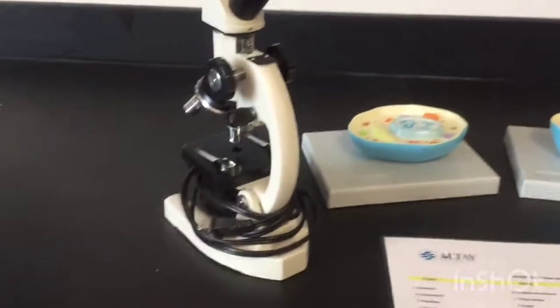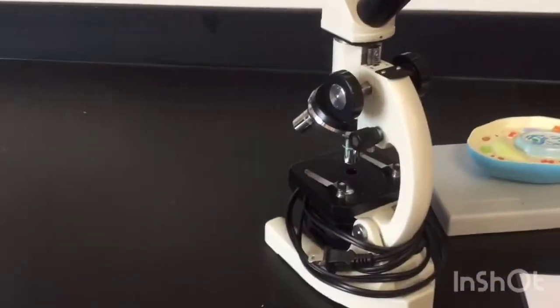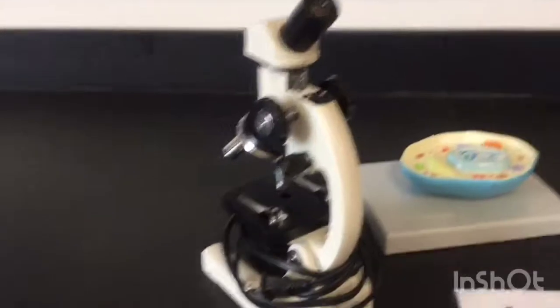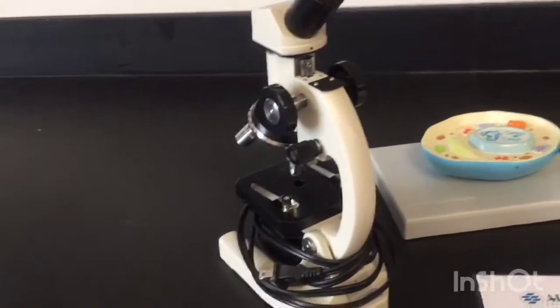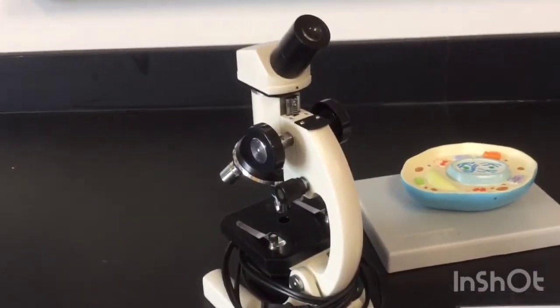I just wanted to share with you some of our resources available related to cell biology. The first is our basic microscopes. We have over 20 microscopes available for loan. What we typically do is loan you enough so that your students can pair up and each have a microscope between two of them. So we rarely would send more than 13 or 14 per classroom.